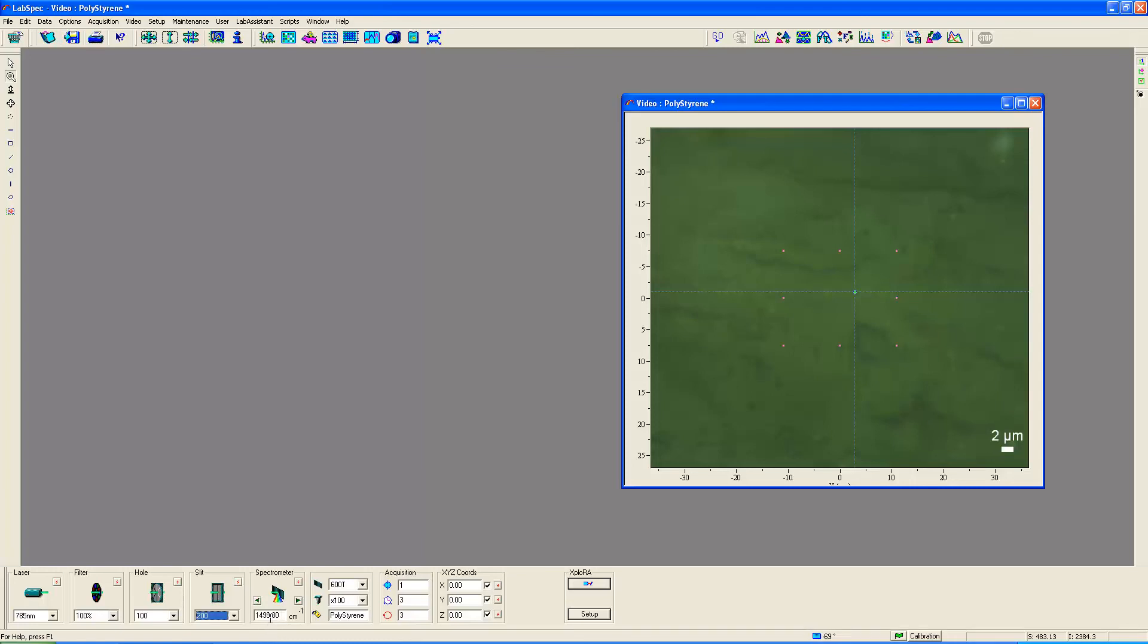By that I mean to say that the very center of the detector, the CCD, that pixel will correspond to this Raman shift in reciprocal centimeters, 1499.80. We have the 600 groove grating that we've selected, and a 100x short working distance, an Olympus objective.